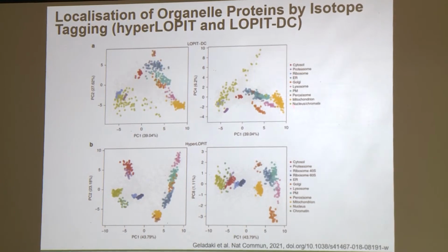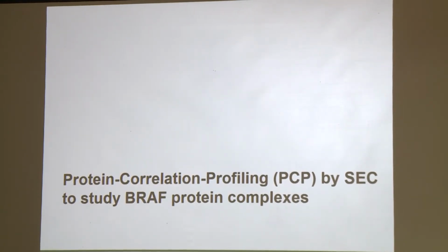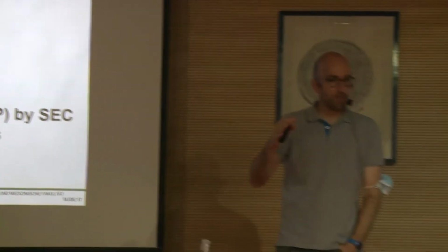It's one thing to look at the known organelles, but what is super interesting is if you have compartments in between organelles, right? There the hypothesis would be maybe these are organelle contact sites or proteins that play a role in organelle contact sites, and there you could try to go a bit more in detail in these types of analyses. Yeah, just to mention that. So this was an example where you fractionate organelles. For this organelle fractionation and organelle interactomics or organelle networks, usually you use centrifugation approaches.